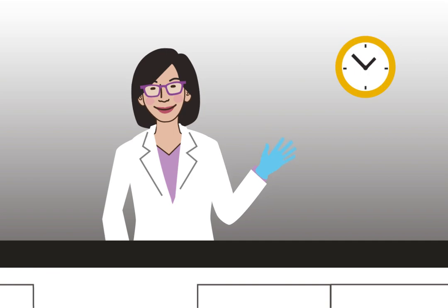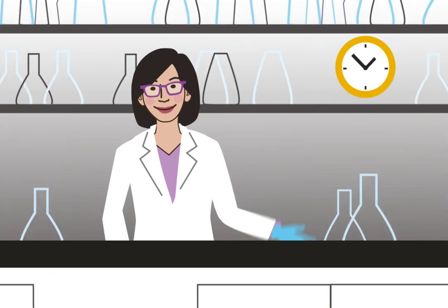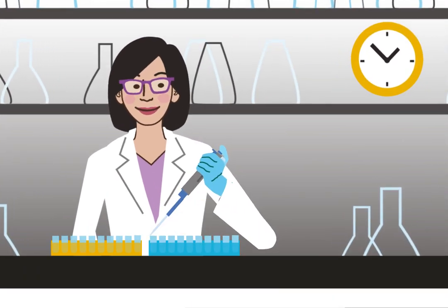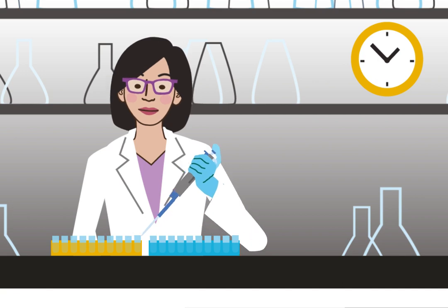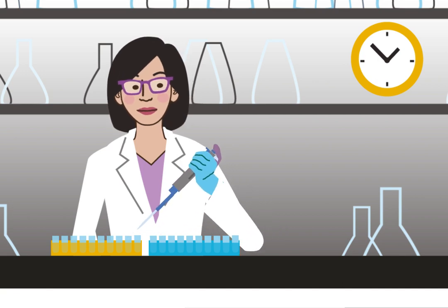This is Michelle. She works as a technician in a laboratory. Part of her work is transferring samples between plates, a repetitive task that takes a lot of time.